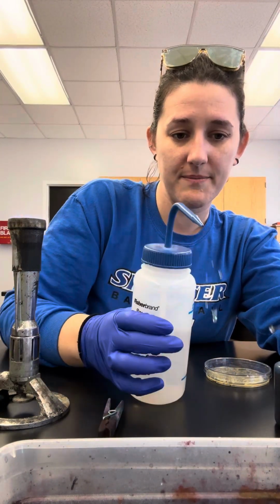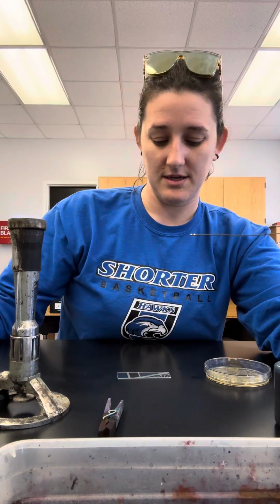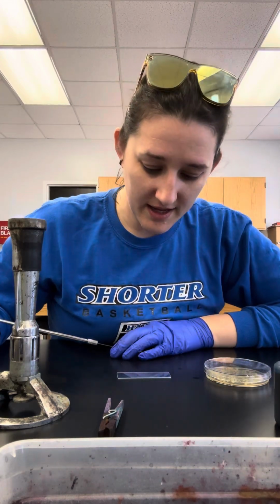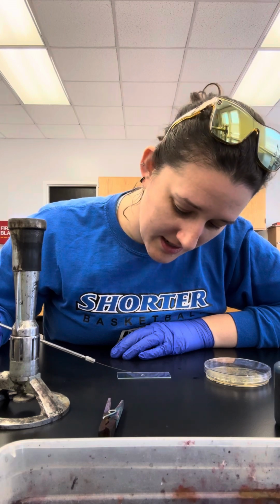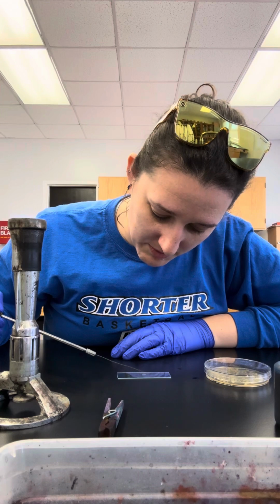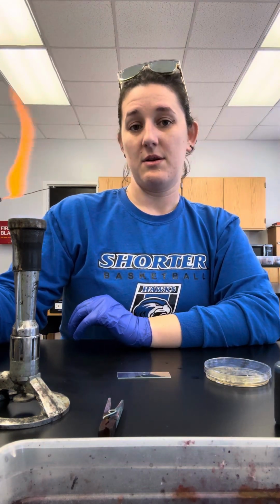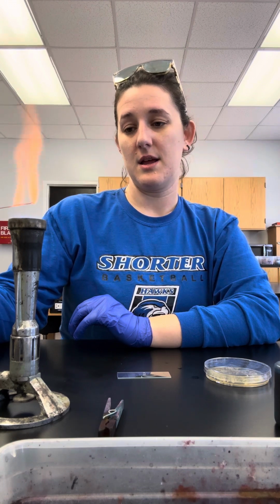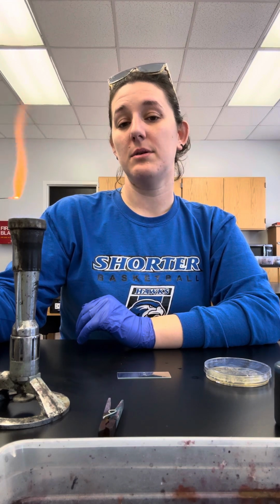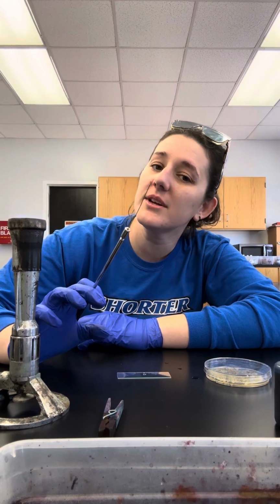You just need a drop. Remember, if you've got extra, you'll tap it off, but I don't have any excess. Okay, good, that didn't get on my slide. All right, so then we put it in the middle of the slide. We give ourselves a nice little drop of water to work with, right? So then we sterilize again, because every time we use the loop, we have to re-sterilize before we use it again. When in doubt, if you can't remember if you did it, do it again.